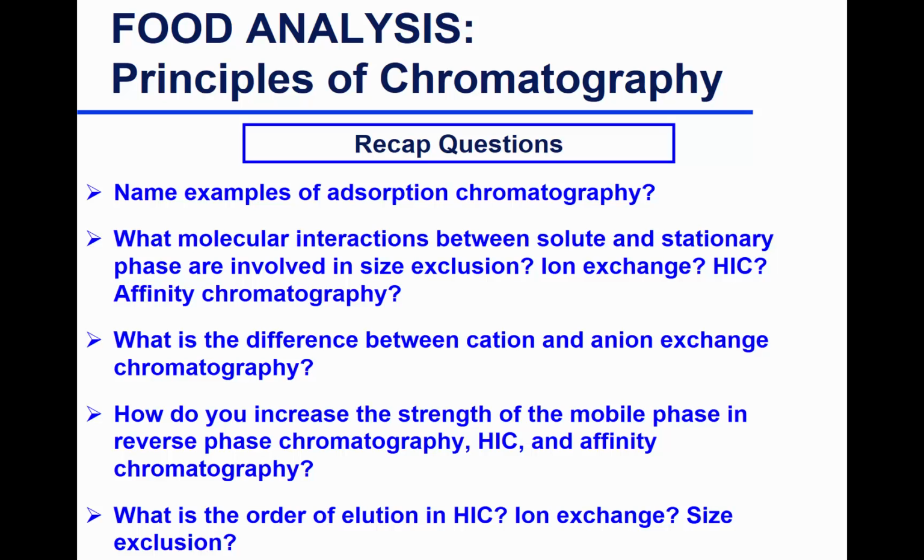What about hydrophobic interaction chromatography? Hydrophobic interaction. Affinity chromatography? Yes, Farah? Hydrogen bonding, but no covalent. If you have a covalent interaction, they're never going to leave this column. They're going to live there and stay there.